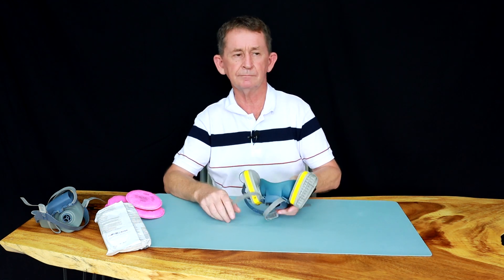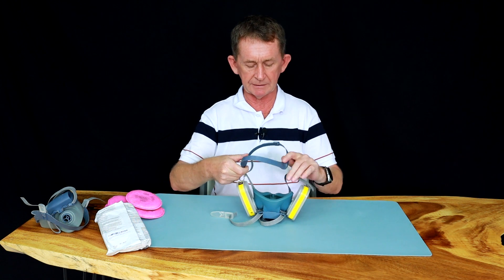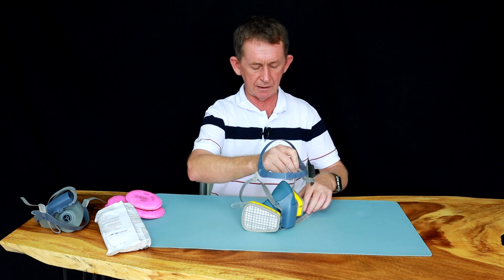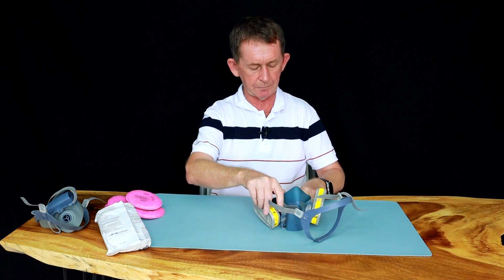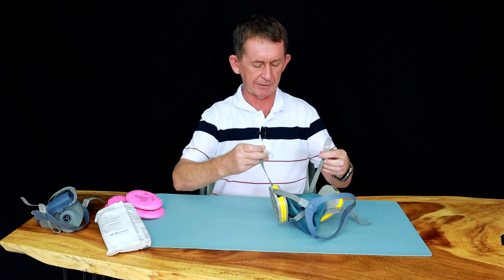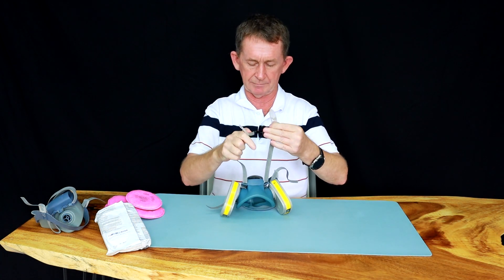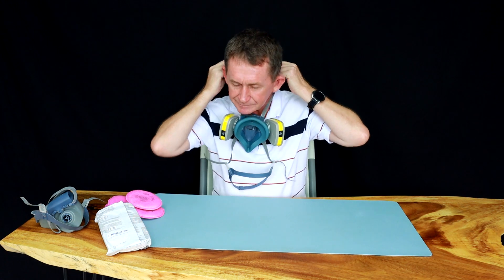There are many different types of filters that fit these masks. To put the mask on, you adjust the straps for the back and for your head — mine would be let out. Make sure you have the straps lined up right, and then put it on like this.